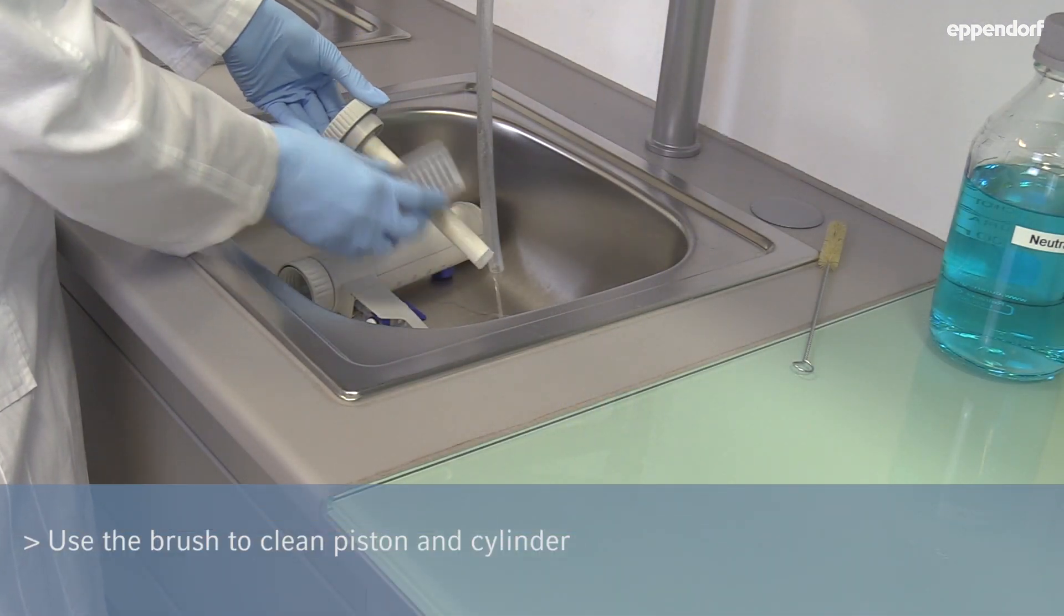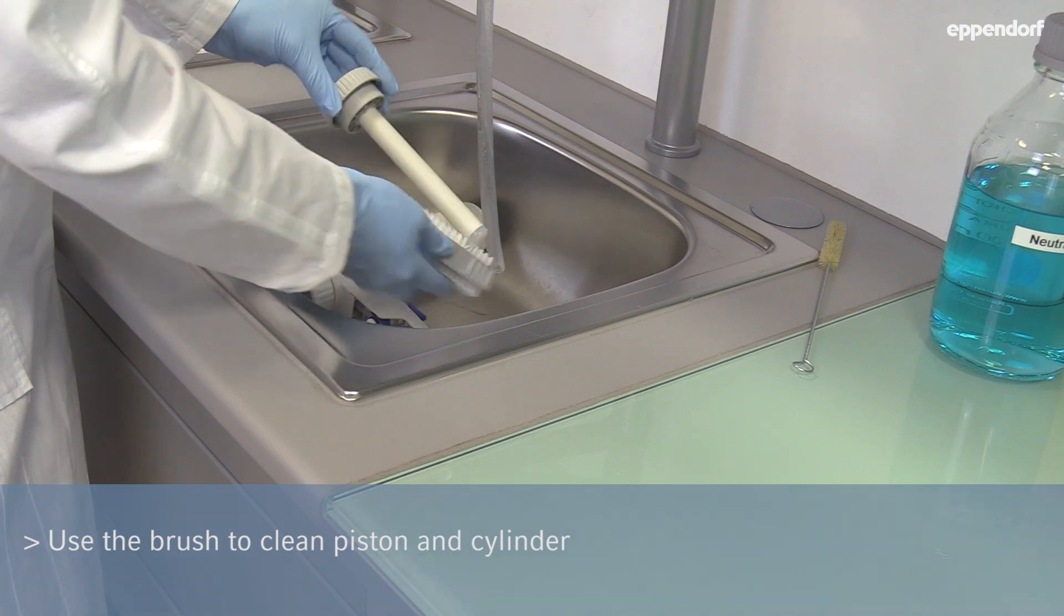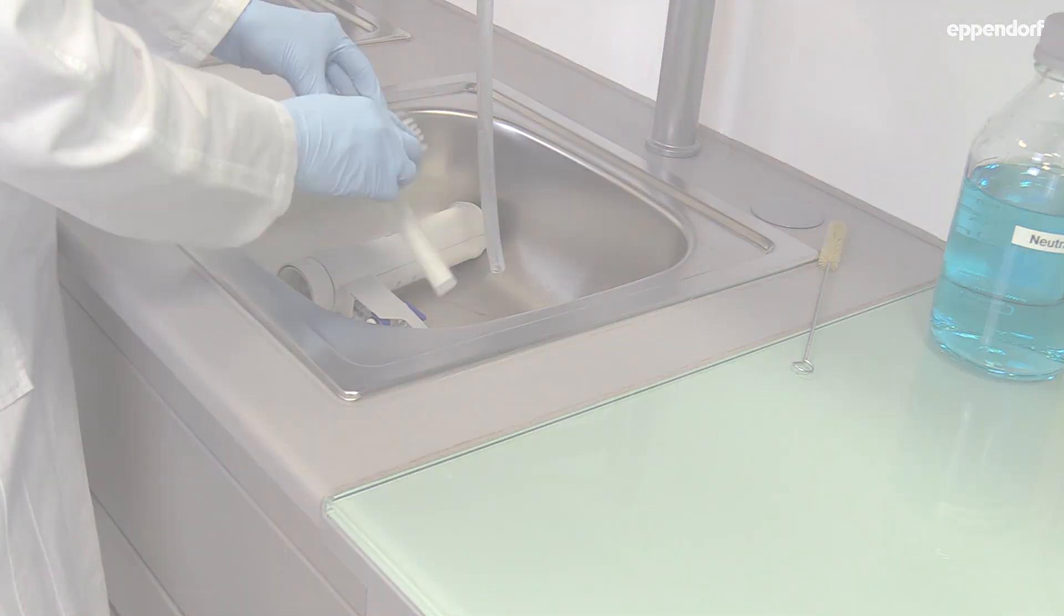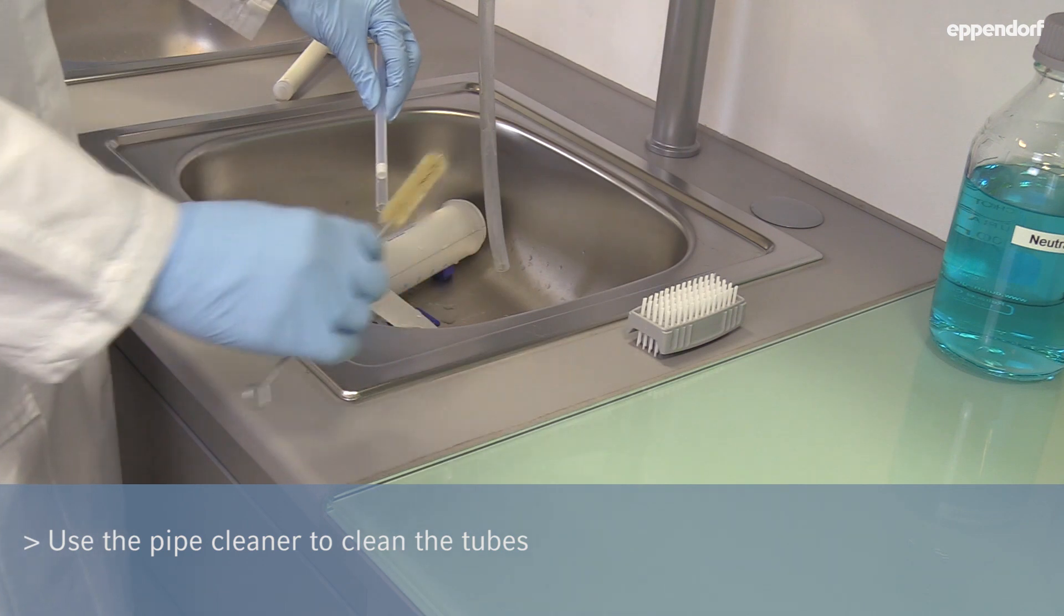Unscrew the piston mount and clean the piston and cylinder with the brush. You may use the pipe cleaner to clean the tubes.